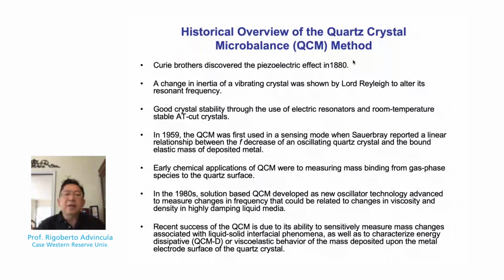In the 1950s, Sauerbrey reported in his famous equation the relationship between the frequency decrease of an oscillating crystal and the mass of a deposited material. In that case, it was metal. And the equation serves best when utilized in a vacuum condition.